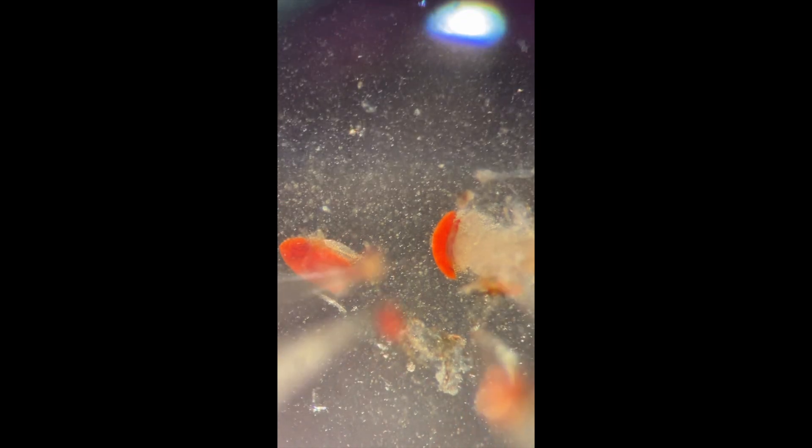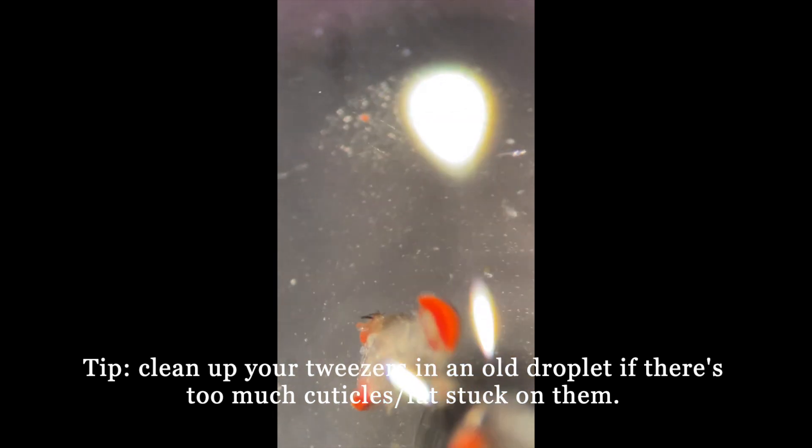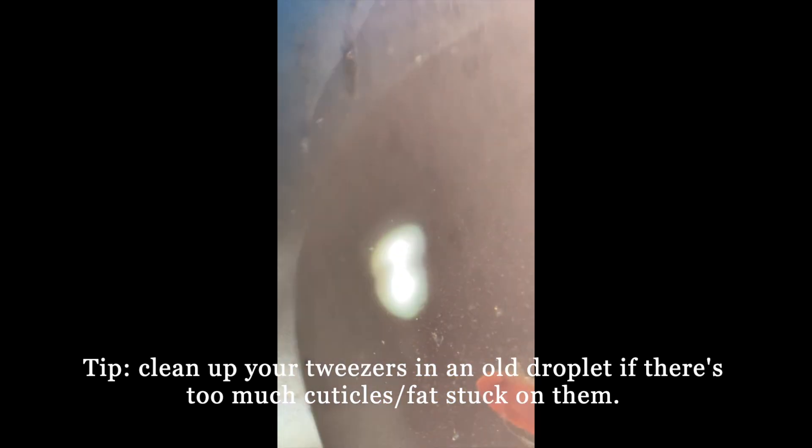Sometimes during a dissection, as soon as we start to peel off the cuticles, a whole piece of retina will come off with the cuticles. But this does not happen every time. So do not get frustrated if you need to peel off the cuticles and the retina little by little. One tip is you can always clean up your tweezers in an old droplet if there is excess cuticle or fat stuck on them.